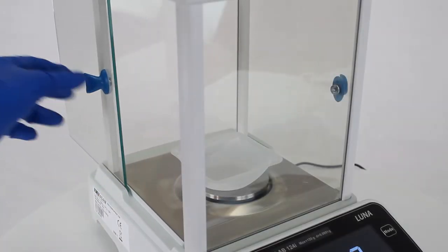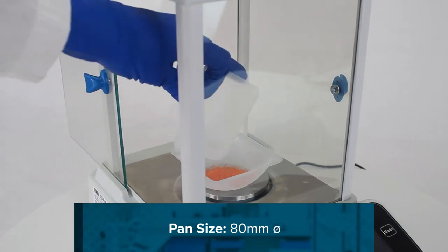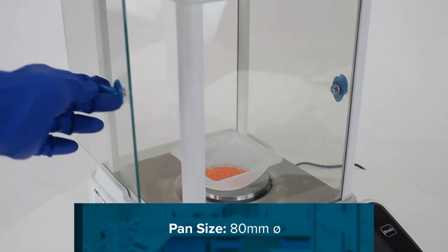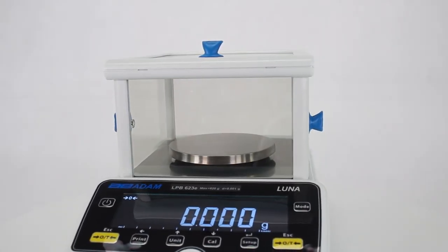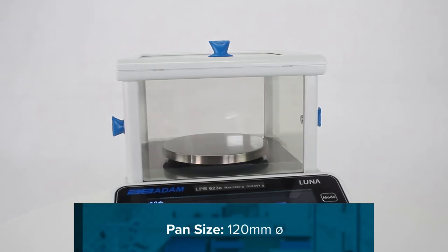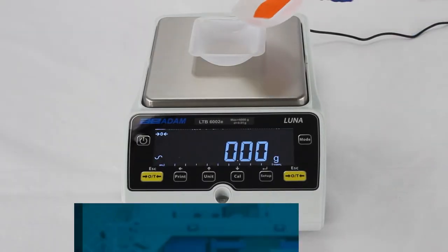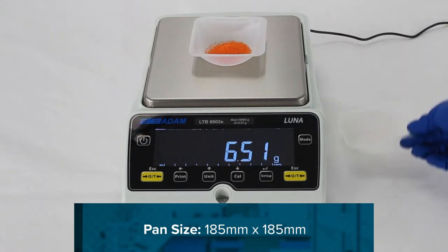The analytical models feature an 80-millimeter diameter pan. Made from stainless steel, the removable pan makes cleanup easy. Precision models with capacities up to 820 grams feature a 120-millimeter diameter pan, while larger models include a substantial 185-millimeter by 185-millimeter square pan.